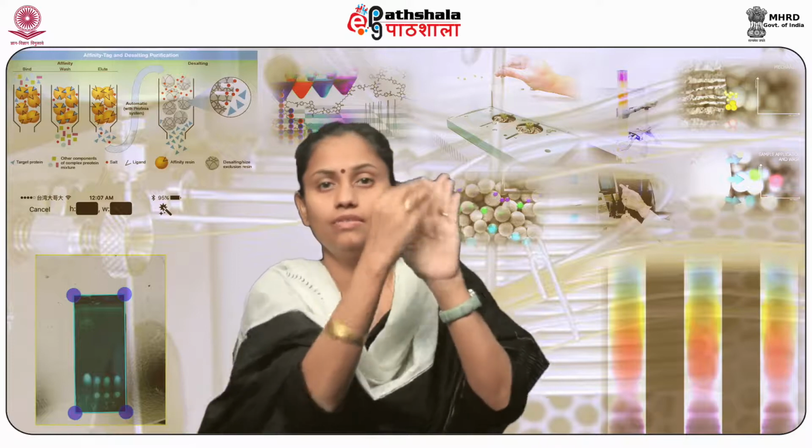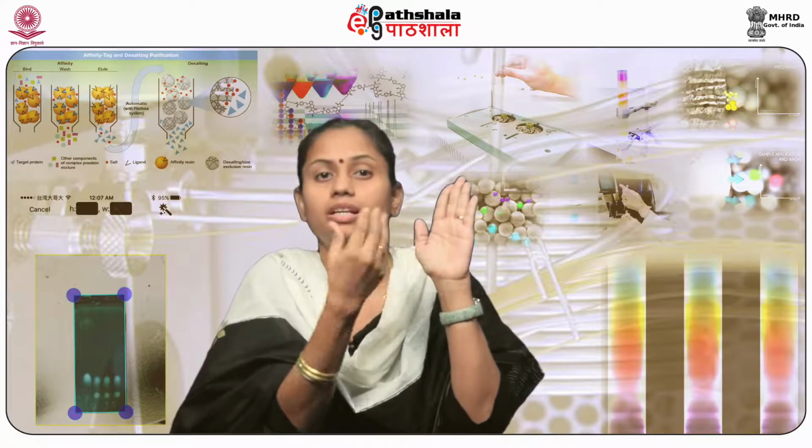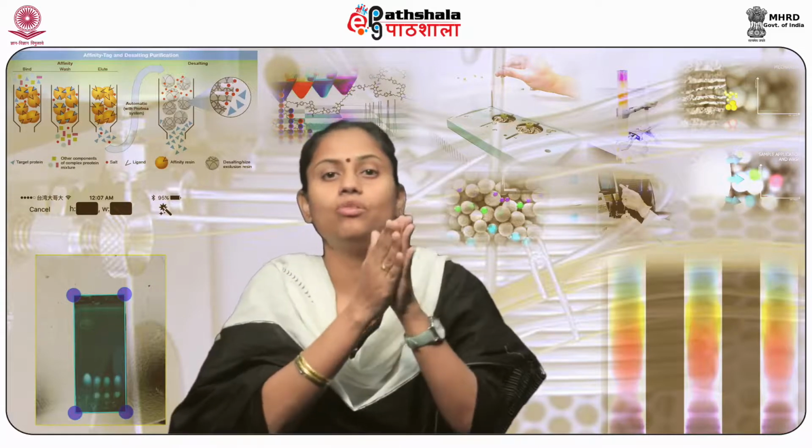The molecules that bind are effectively concentrated onto the column, while the contaminants or other substances that do not have the correct surface charge pass through the column along with the flow of buffer, eluting during or just after sample application.